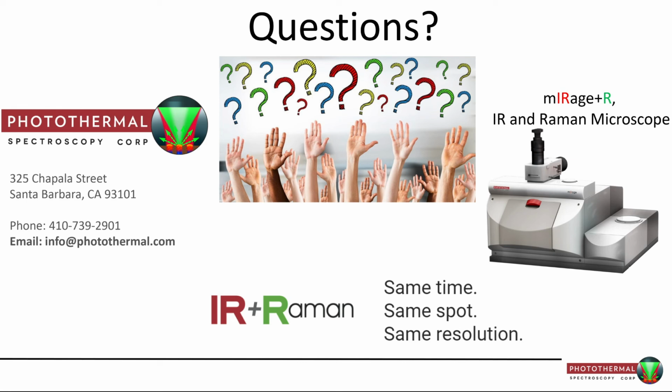Next question. What is the depth of sampling? So that's probably one I'll take. The depth of sampling, of course, depends. It depends on the nature of the sample, how absorbing the sample is, which infrared wavelength you're at. But as a rule of thumb, as an approximation, we typically say it's a few microns to maybe several microns depth-wise that you'll be measuring from.